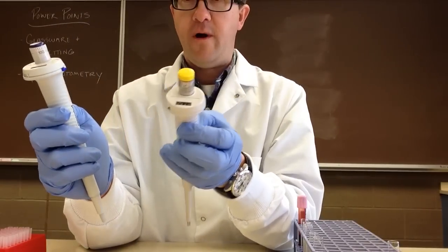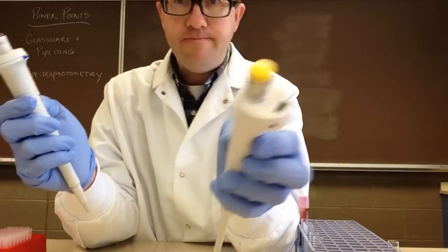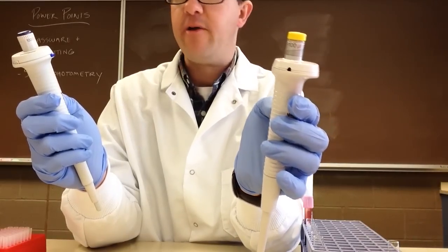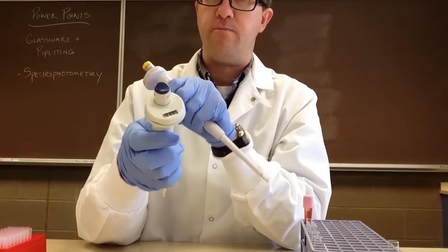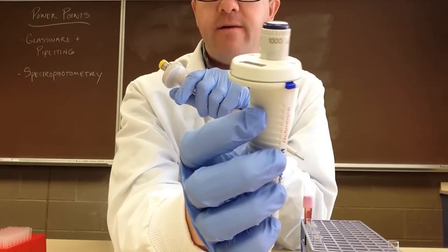Here we have one that has a yellow top, and that has a volume of 10 to 100 microliters. Then the larger ones, which are blue, have a volume of 100 to 1,000 microliters.